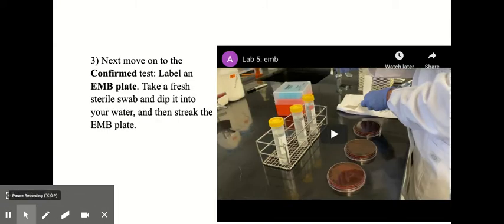So next we move on to the confirmed test, which is the EMB plates. And those are also testing for coliforms. But remember, they can be even a little more specific than the presumptive test in that they can distinguish between general coliforms and E. coli, because E.